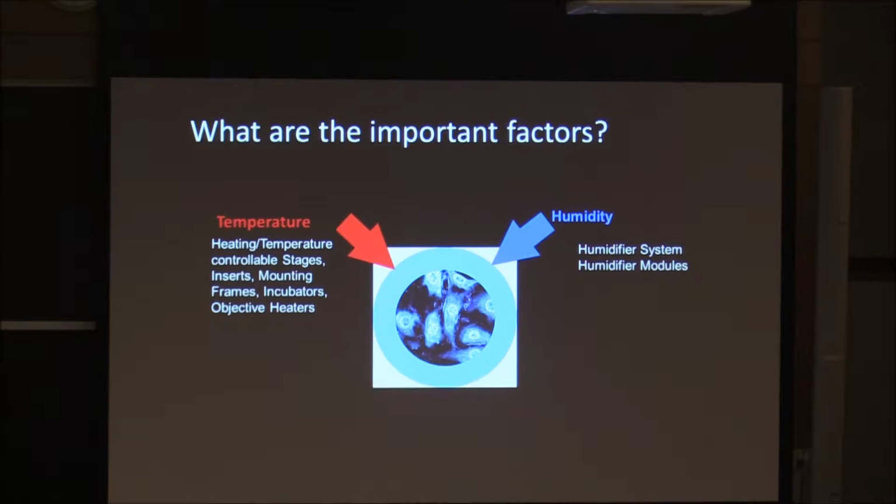That volume evaporates pretty quickly. It changes the concentration of the salts that are inside. As well, sometimes people who are doing bacteria work have a little agar pad on top of or below their sample. That can dry out pretty quickly. So humidification is actually really important. This is something else that you need to consider, especially if you're doing a longer term experiment, multiple hours, multiple days.